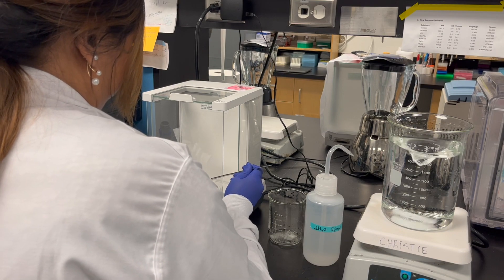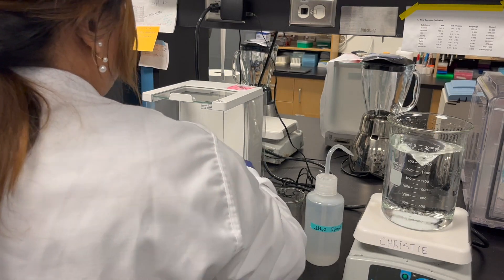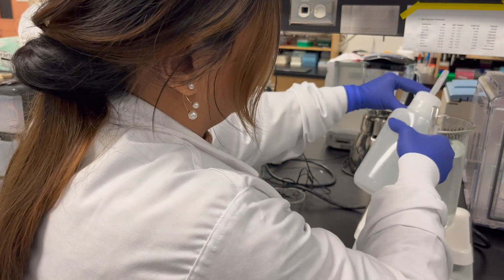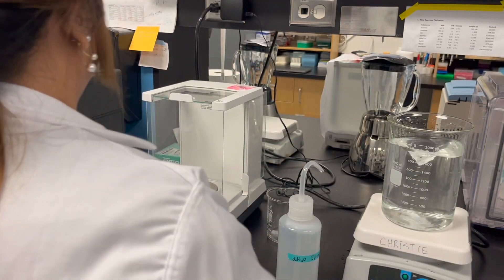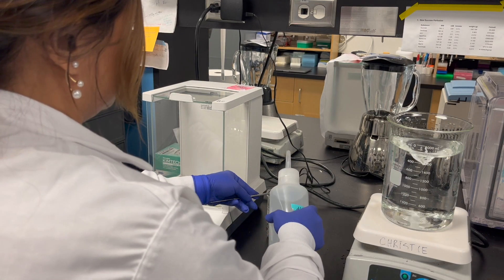The stir bar mixes the solution continuously so that all solute becomes fully dissolved. A squeeze bottle containing deionized water is used to rinse the weigh boats to ensure that all solute is washed into the beaker. And to prevent contamination, Crystal cleans her utensils between each chemical.